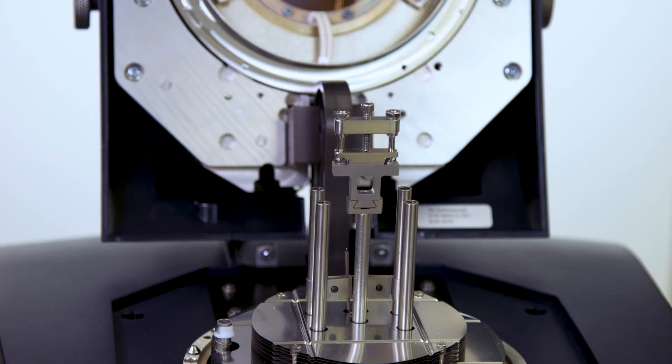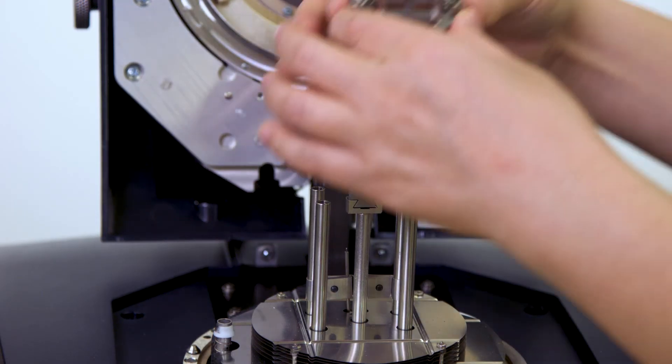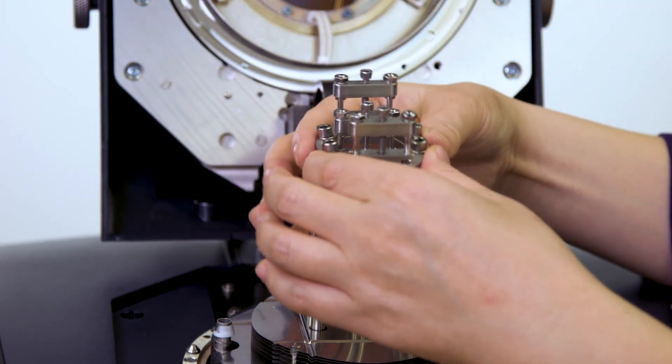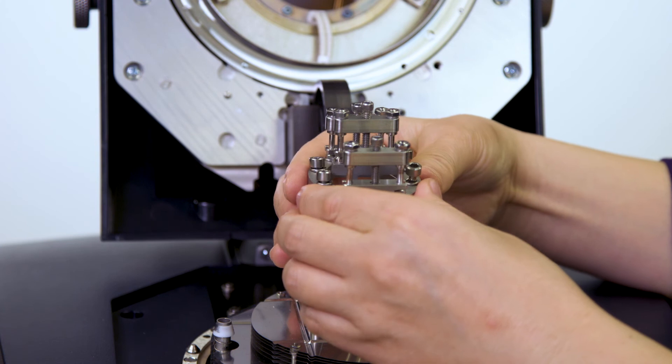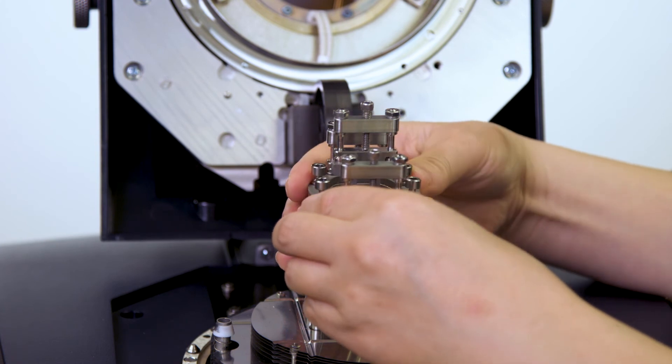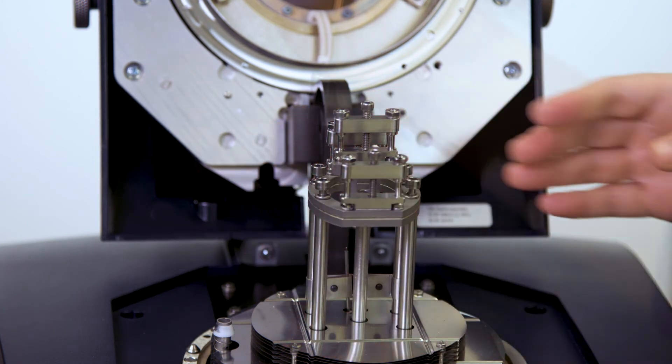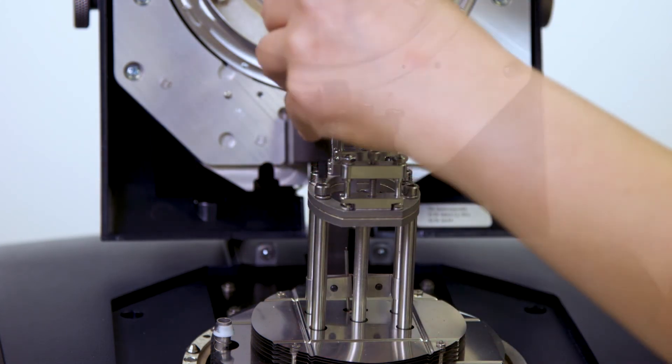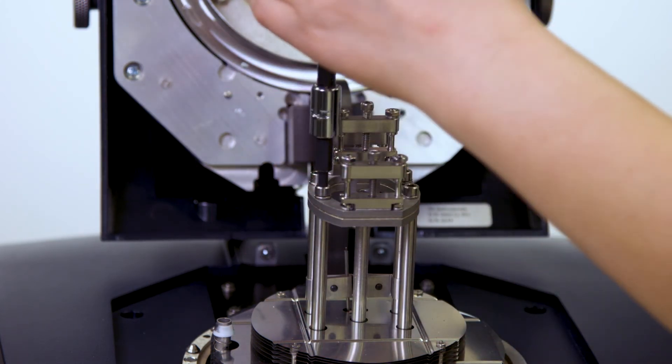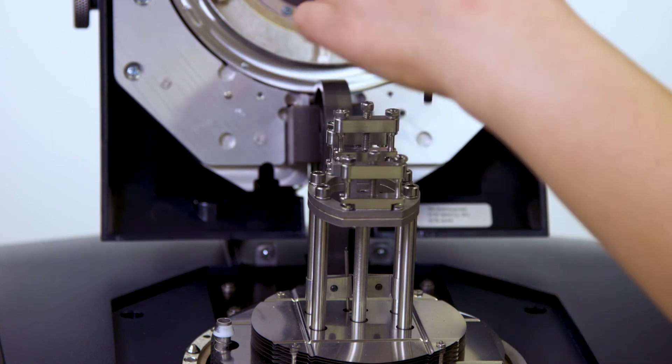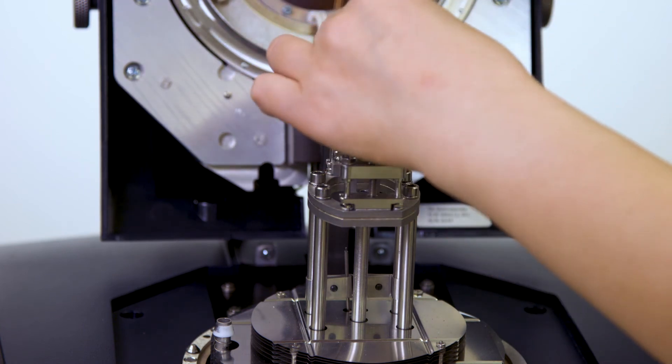The second step is clamp compliance calibration. Install the stationary clamp to the four posts. Tighten the screws with the torque wrench set to 10 inch pound.